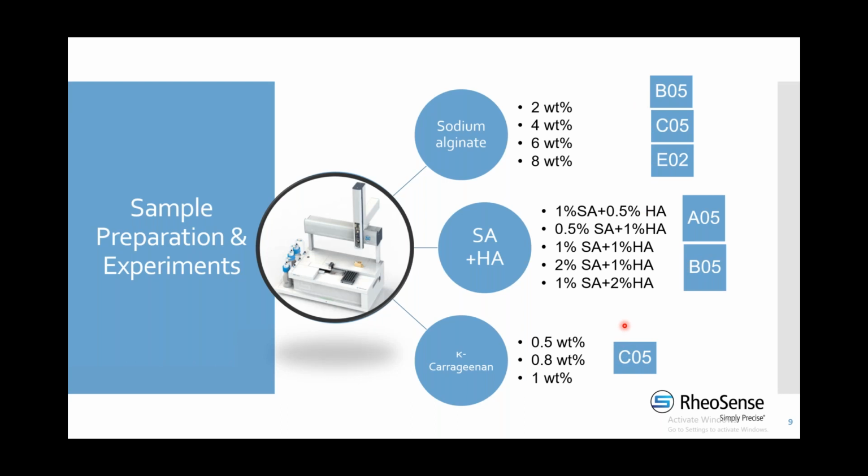For example, A chips are able to measure the lowest pressure for low viscosity fluids, and the E chips are able to measure the highest pressures for higher viscosities and higher shear rates. So quality data can be obtained by simply choosing the appropriate chip depth and pressure sensitivity.